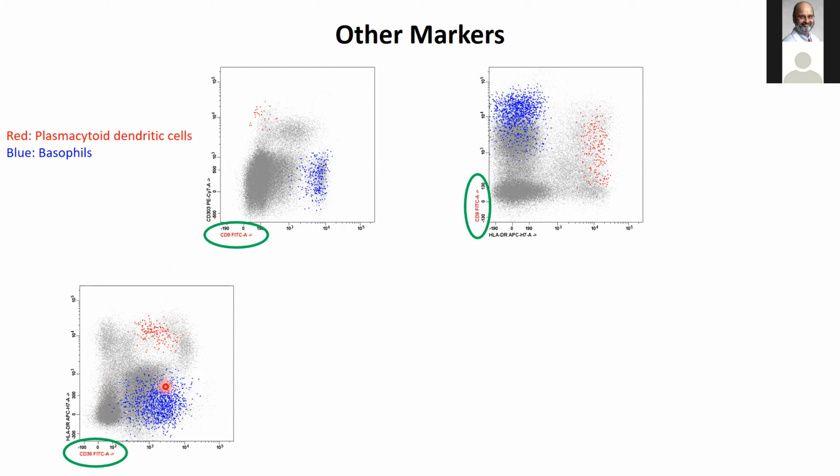One thing to keep in mind anytime you're looking at CD36, always pay attention to your background neutrophils. And the reason is normal neutrophils don't express CD36, but platelets do. And platelets are sticky, so they can stick to your normal cell populations. So if your neutrophils show staining for CD36, then you have to take everything else with a grain of salt, right? You've got to realize that you may not have true expression of CD36. It might just be platelets adhered to it.